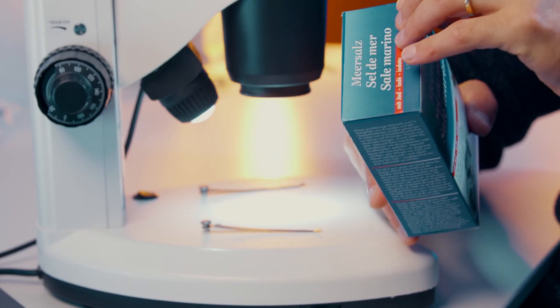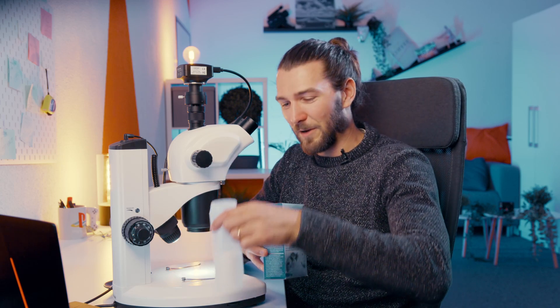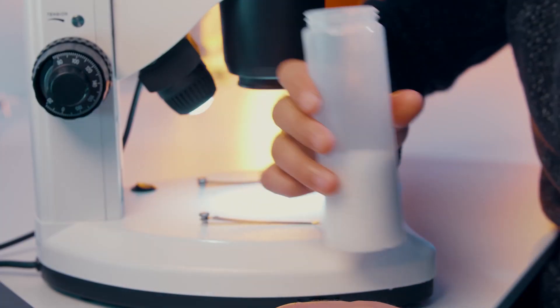I'm gonna open up the sea salt. I rinsed this container pretty well already. We've filled it up now about one quarter. Now I'm gonna get some water and mix it up. 20 minutes later, this is now pretty concentrated water.